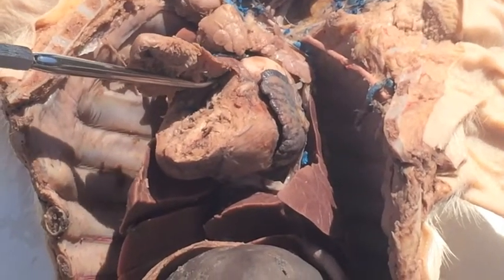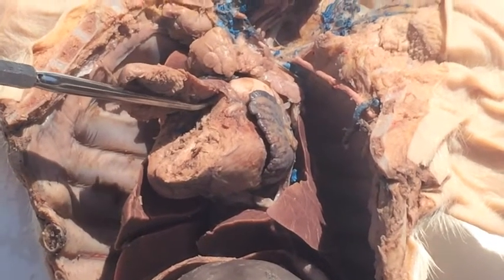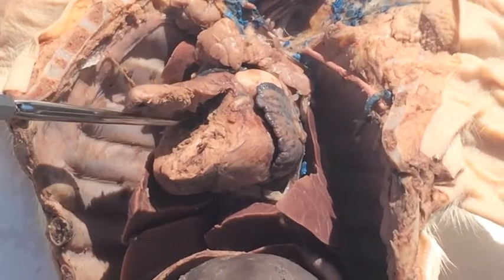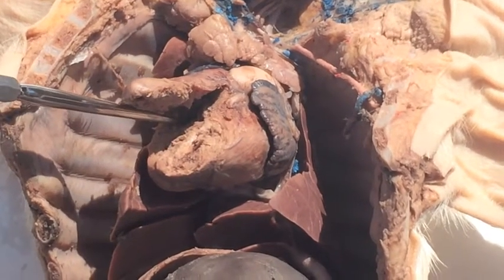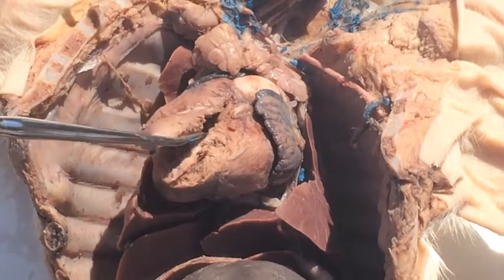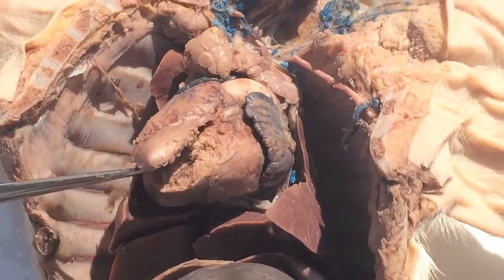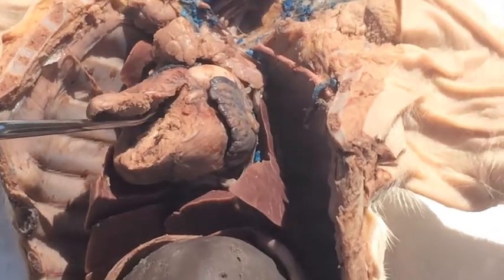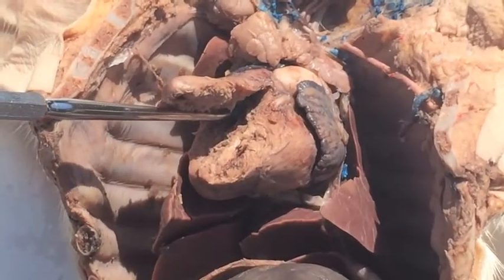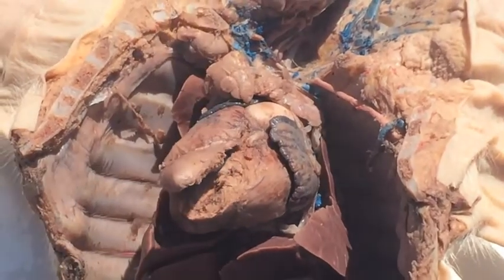Next we have the tricuspid valve, which is the right atrioventricular valve, so it's going to be more on the right side, and that is responsible for guarding the atrioventricular orifice between the right atrium and the right ventricle. Next we have the bicuspid valve, also known as the mitral valve, which controls the flow of blood in one direction through the left side, which will basically be over here on this side of the heart.